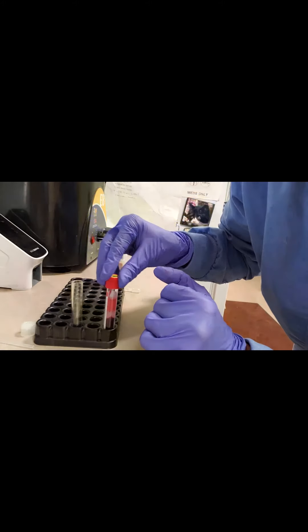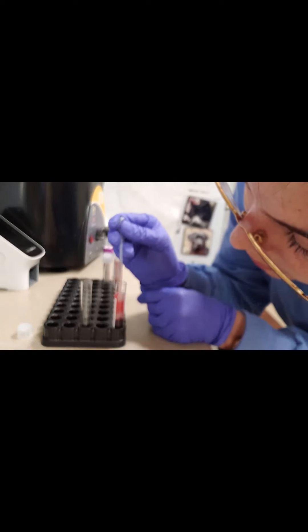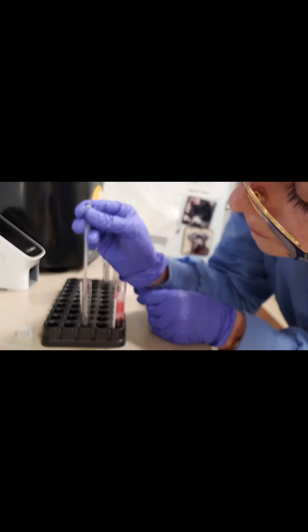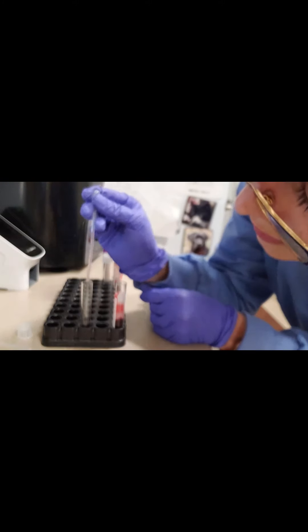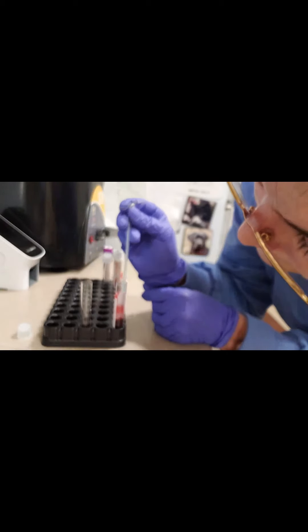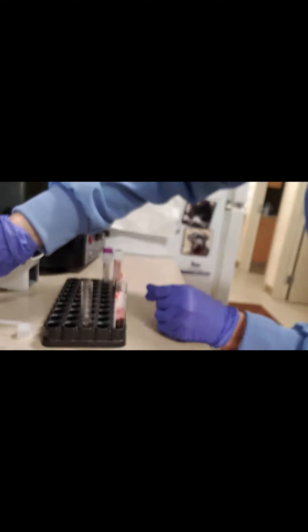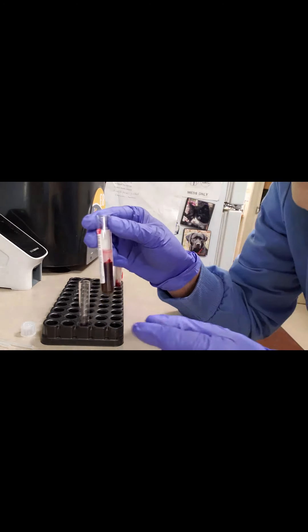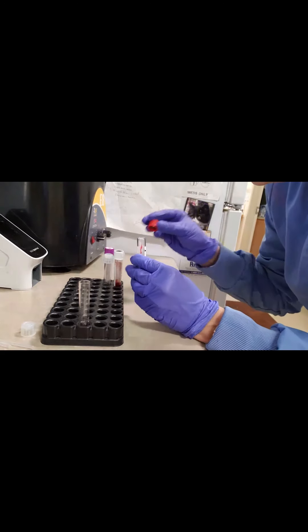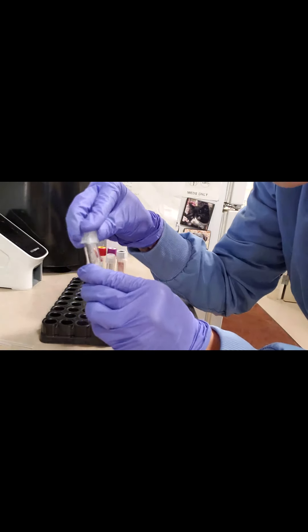Last but not least, we have our serum separator tube. This one's a bit easier to see — we want to make sure we're taking the serum, not disturbing the red blood cells. This one's a little bit easier because of the serum separator gel in between, but you still want to be gentle because that separation gel can be sucked up. That just leaves us with our red blood cells and our transparent tube with our serum.